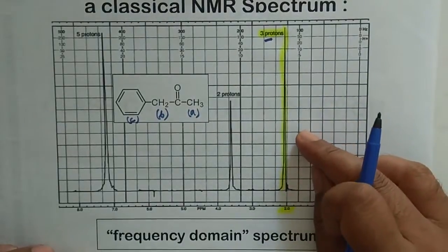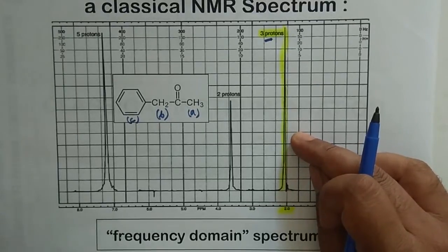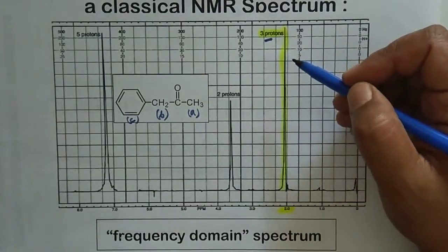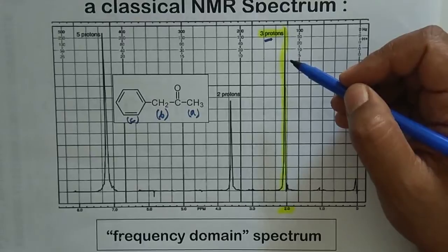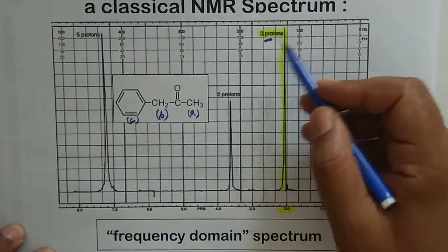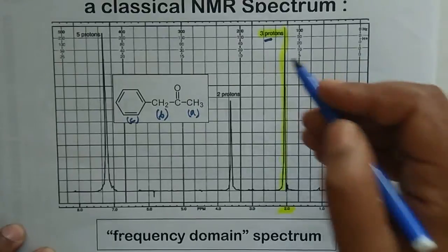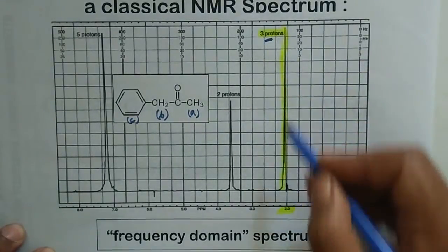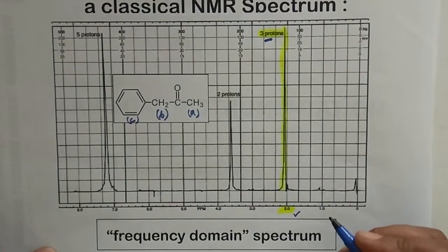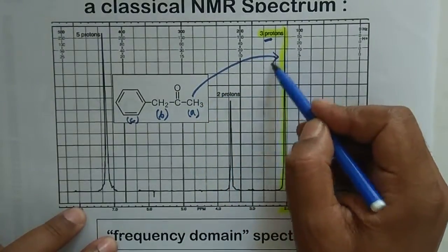However, this thing you will learn only when you solve various structures, and when you do research based on this. When you do research on your natural products or any kind of compounds, and you solve the spectra of your compounds, then you will learn these things. But right now you can understand it in this way. If we calculate the area under the peak, and it corresponds to 3, that means 3 such protons are there, and 2.0 is the chemical shift. Okay, now this particular signal belongs to this nucleus.